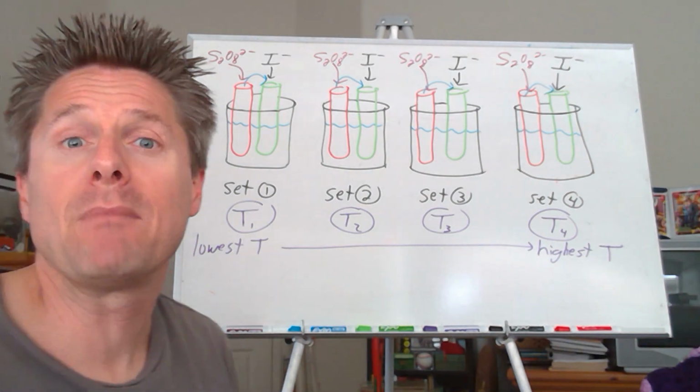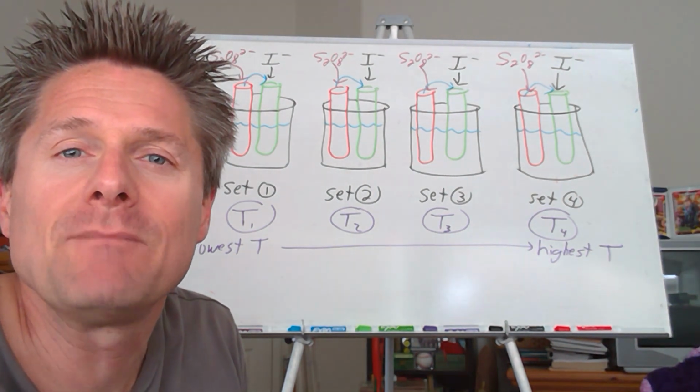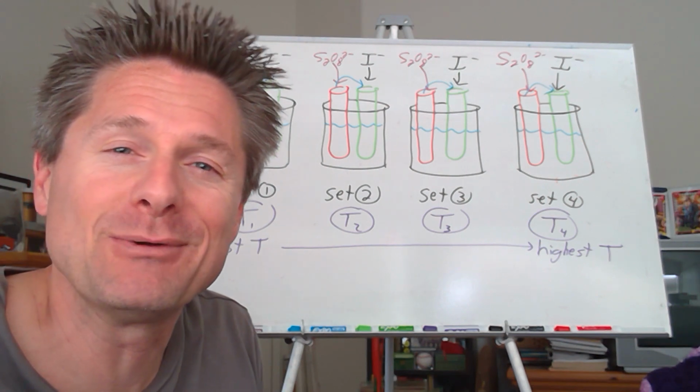So I'll give you all that primary data. Very straightforward lab. And then once you calculate that activation energy, send all your data to me and I'll grade your lab. It's actually kind of a fun lab. I can't wait to go in and do it. Enjoy, guys.